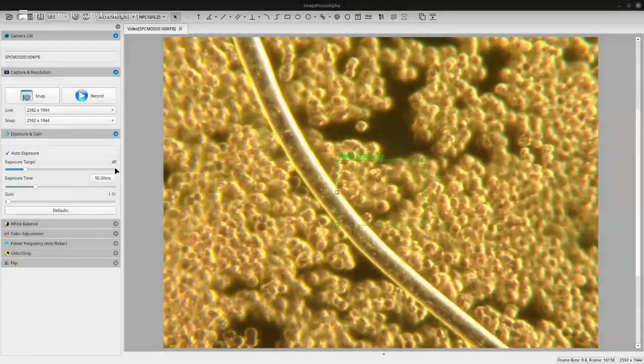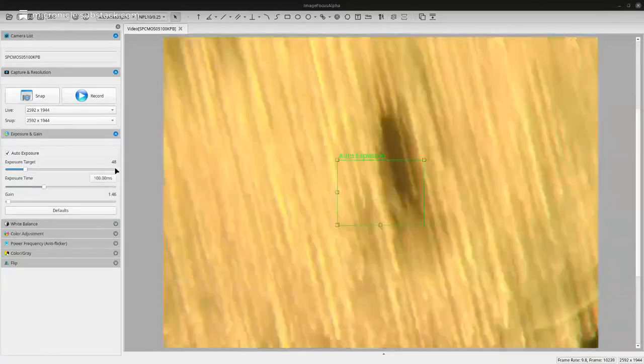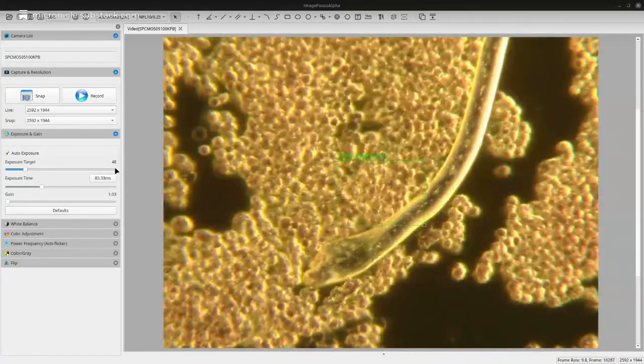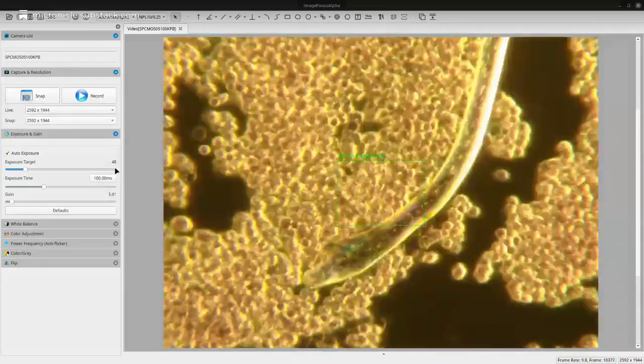Anyway, dark field makes this look perfect. I'm just going to scan back down to the bottom again and get to the other end of the head. I call this the head, dragon head. You want to be dramatic. And put the polarizer on, of course, because dark field and polarization, always good.